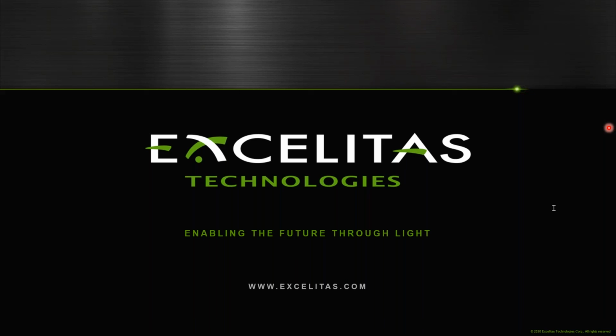Wishful thinking, I would hope so, but the laser costs are still pretty high. So maybe in the next 20, 30 years that would happen. But as of now, the cost is a restriction, and the electronics required to run a laser.